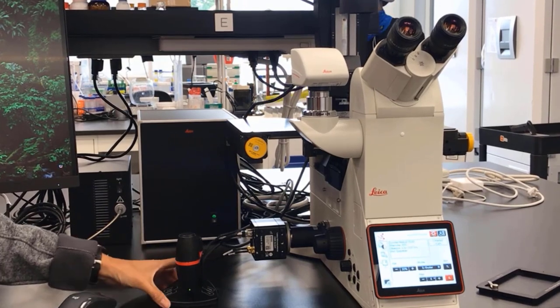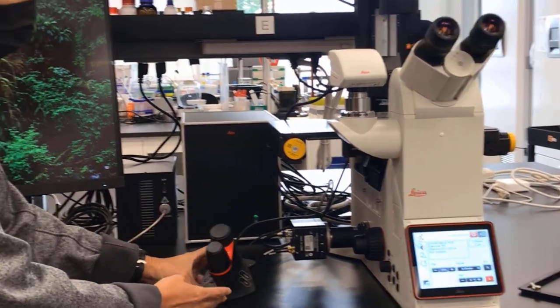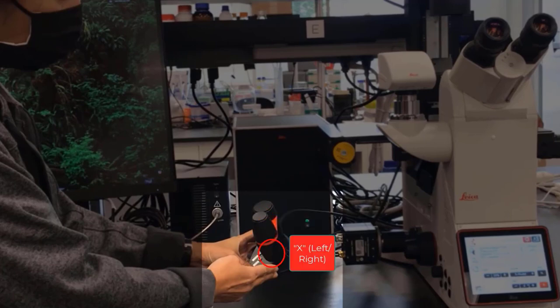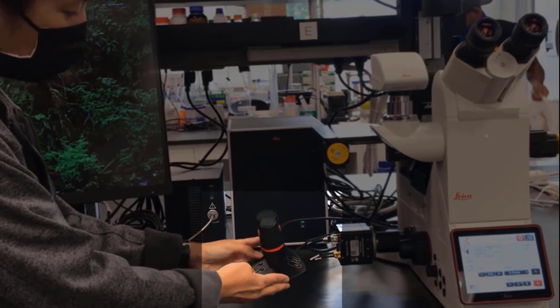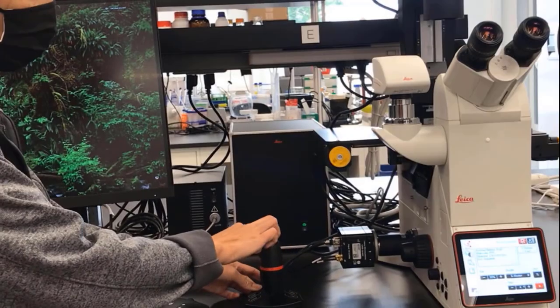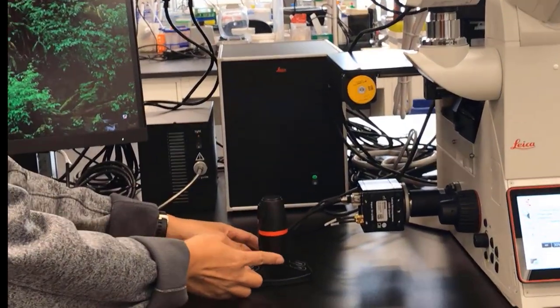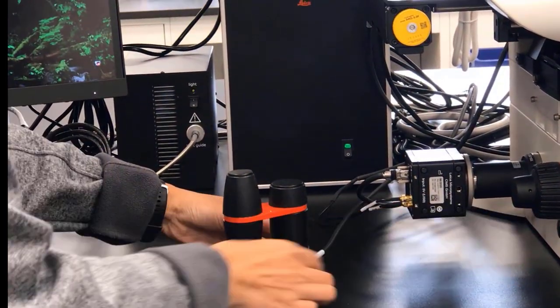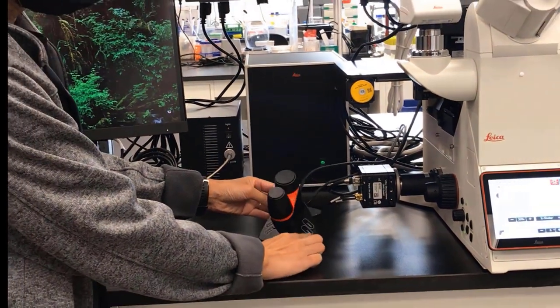Next, let's look at the smart move, which controls your stage and your focus. The back button is for Z focus, the front top is for Y, and the bottom is for X. Moving the front wheels moves the stage in Y and X. The back is for the focus, and you can also use the focus knob if you're more comfortable.